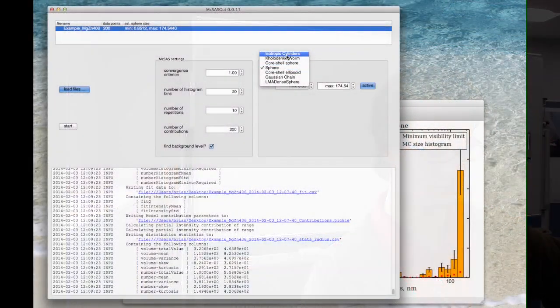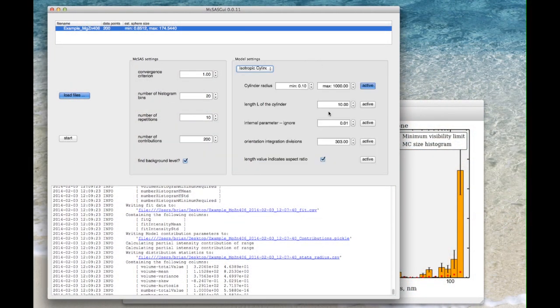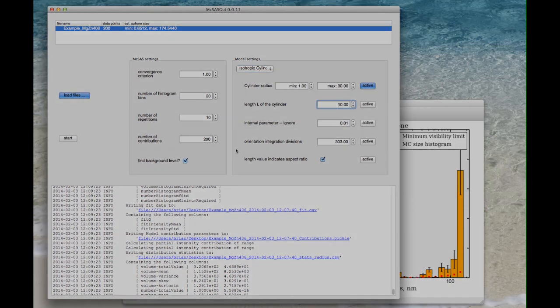The closest that we have at the moment is a different model which is isotropic cylinders. I can now start a Monte Carlo fit using cylinders instead.